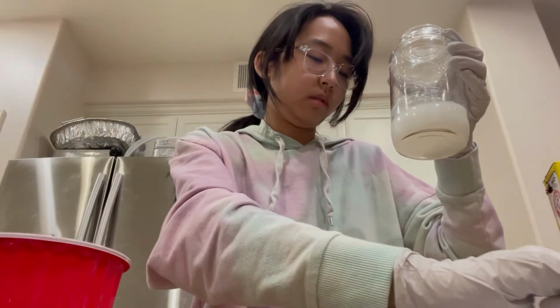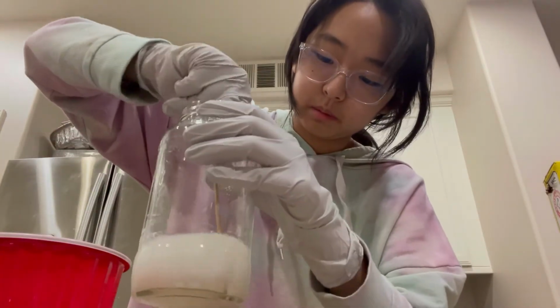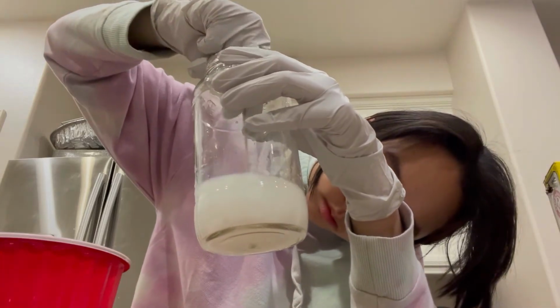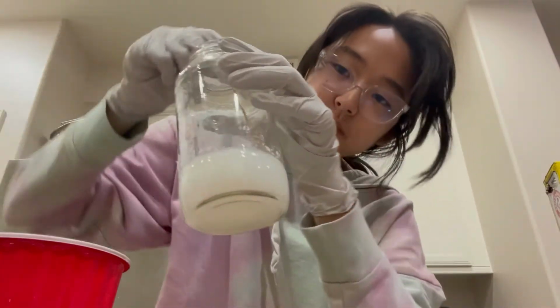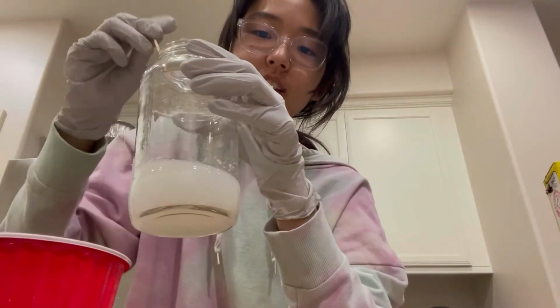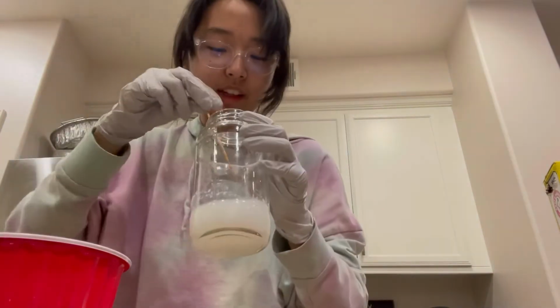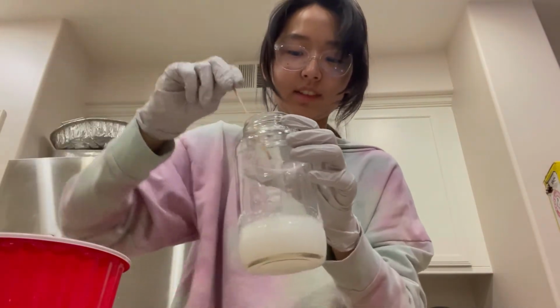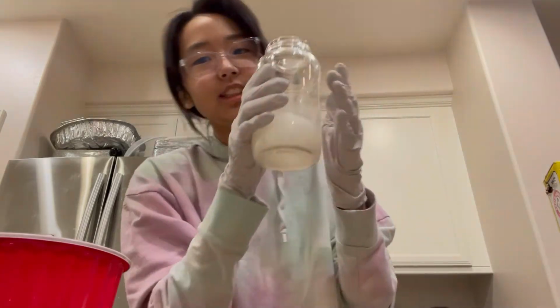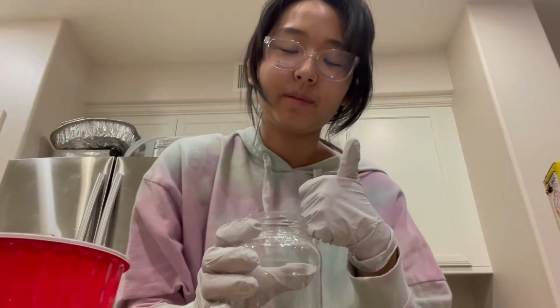If I take one of these stir sticks, yeah, it completely changed its color. Well, I think that's the precipitate. Fun! And this is an actual real life example of finding a precipitate.